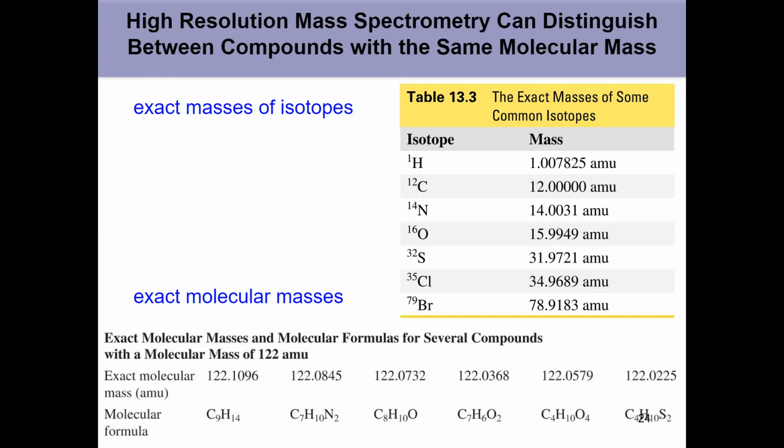But just be aware that high-res does exist. It can calculate it to the nearest 10,000th of an AMU so that it gives you the exact formula. No rule of 13 necessary. Okay? That's calculated by using a computer program. About $2-3 million a piece for these high-res instruments.